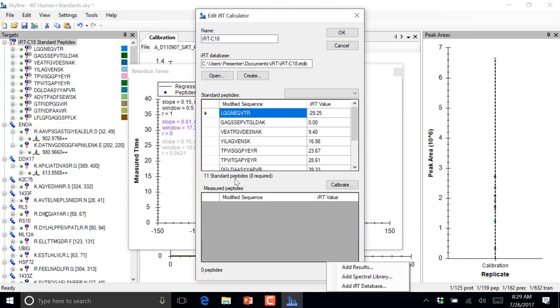But there's lots of problems with that, including, I think somebody mentioned, when you start looking at the IDs, you see how much of the chromatography they cover. If you have a tailing peak, not very sharp, and it kind of goes out like this, then you can get a median retention time pretty far away from your apex. It turned out that in some data I got from Bruker, 3 of the Biognosis IRT peptides had this tailing. So I actually had to use, they don't use the median time, they use the like 30th percentile time just to get them closer to the apex.